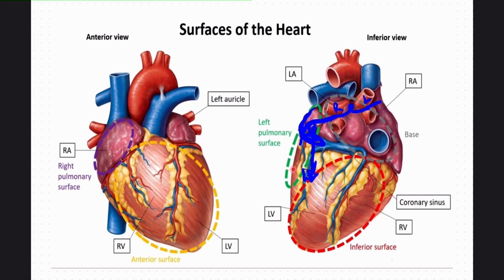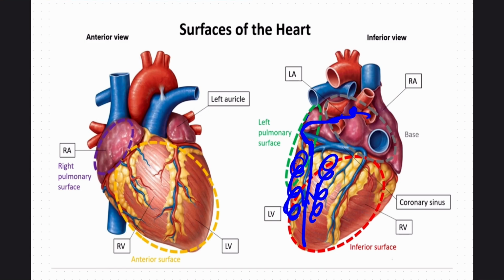The left ventricle has two sets of papillary muscles. In between here, you extend through the left atrial appendage, extend through the posterior bicuspid leaflet, and enter the left ventricle. Cut in between the two papillary muscles, enter into the left ventricle on the posterior surface up to the apex. This is the inflow of the left ventricle.